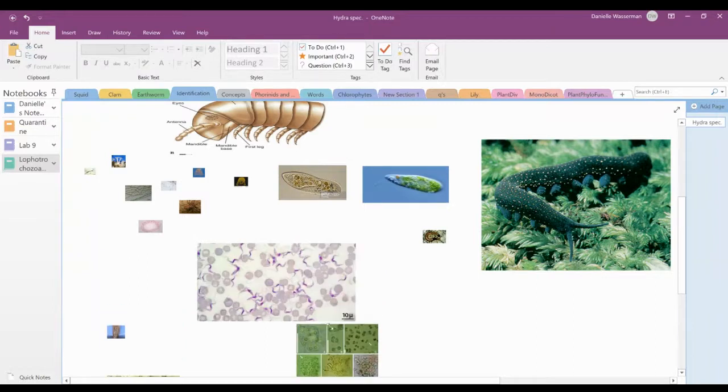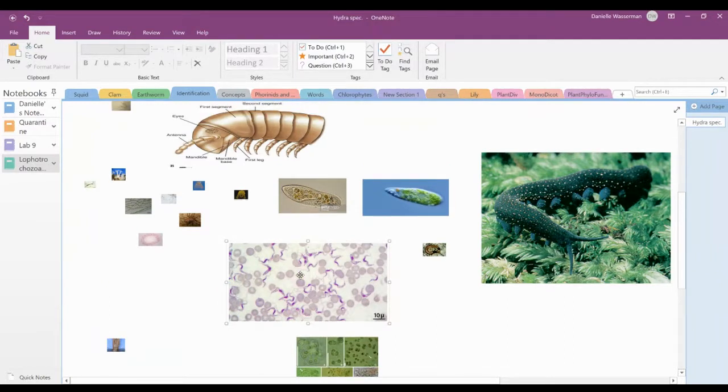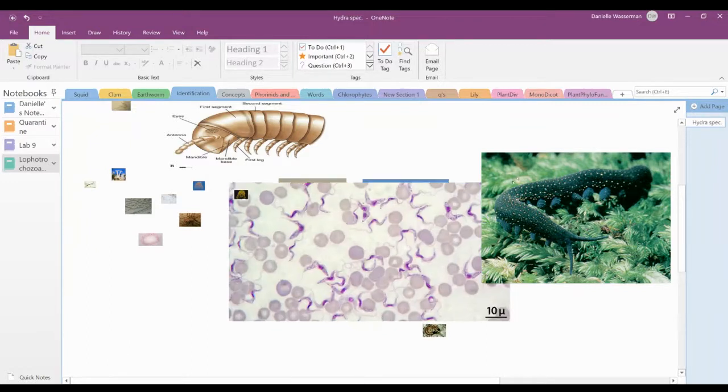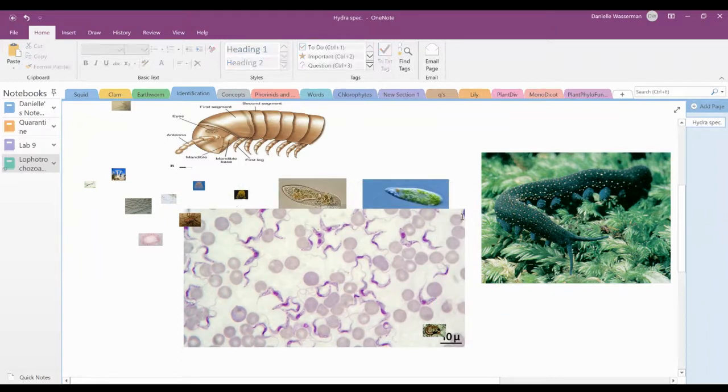Positive. So here is something we looked at, a slide of these. So you can ask, what is the name of this? And our slides looked very much like this. The creature is the dark. And these are hosts. It's a parasite. Starts with a T.